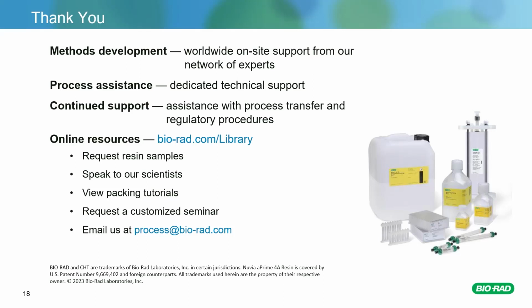Yeah, that's a very practical question, but the answer is quite complex. So theoretically, there is no limit for numbers of factors that can be tested in the DOE experiment. However, to get the most from the DOE approach, you should find the balance that suits you between numbers of factors to be tested and the resolution to be achieved.